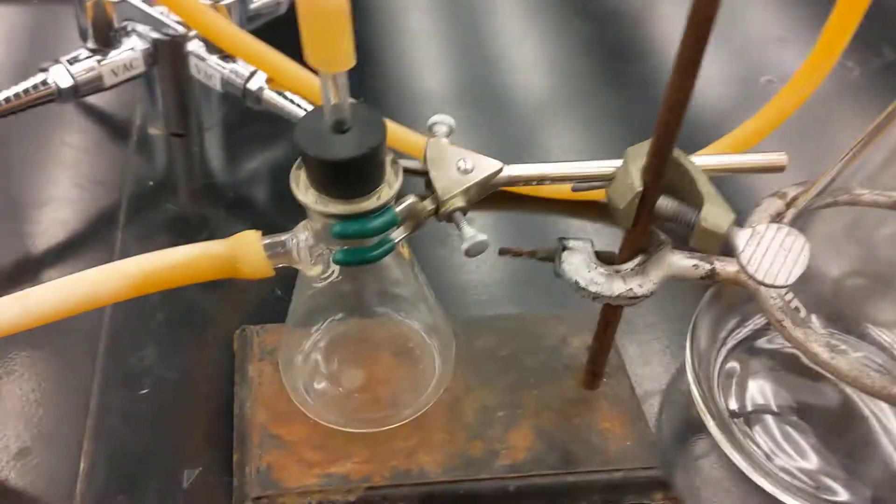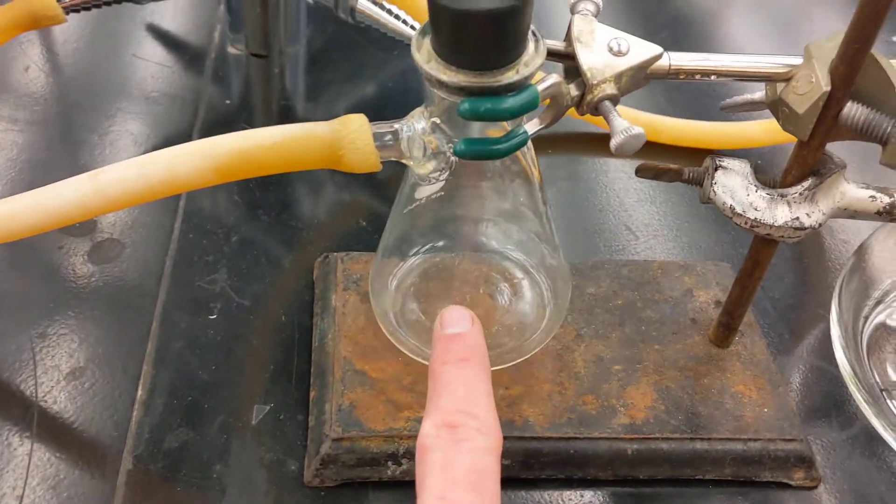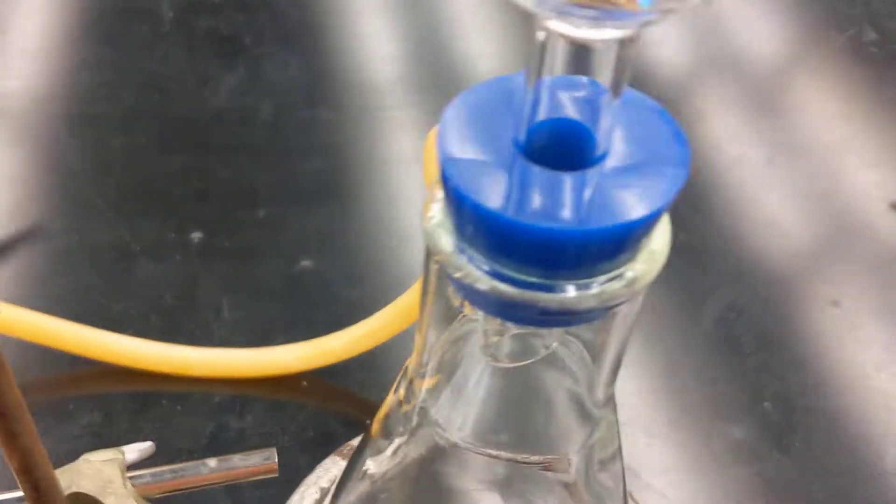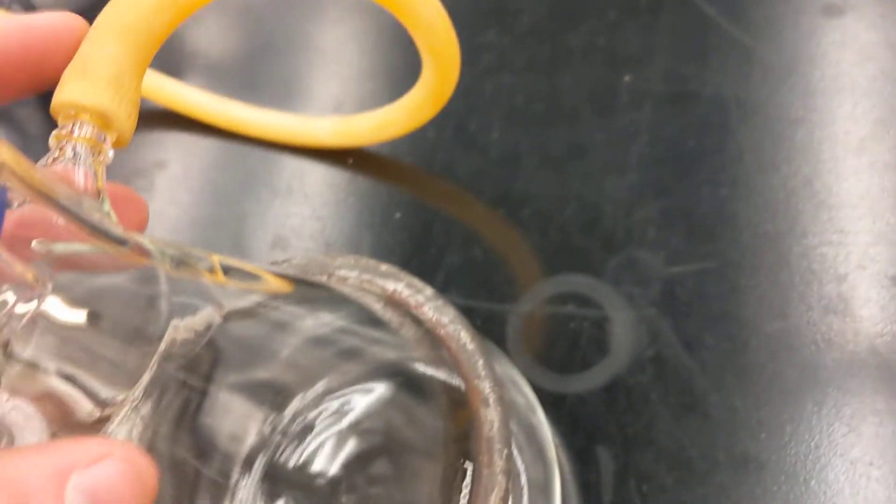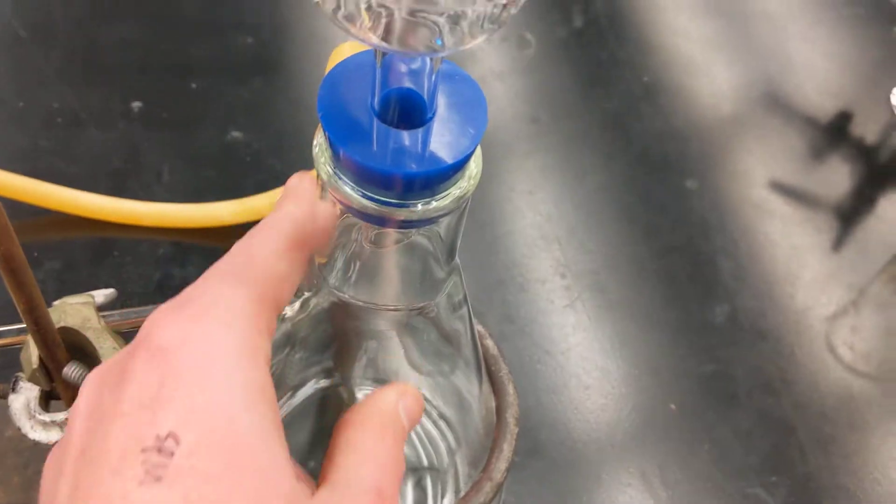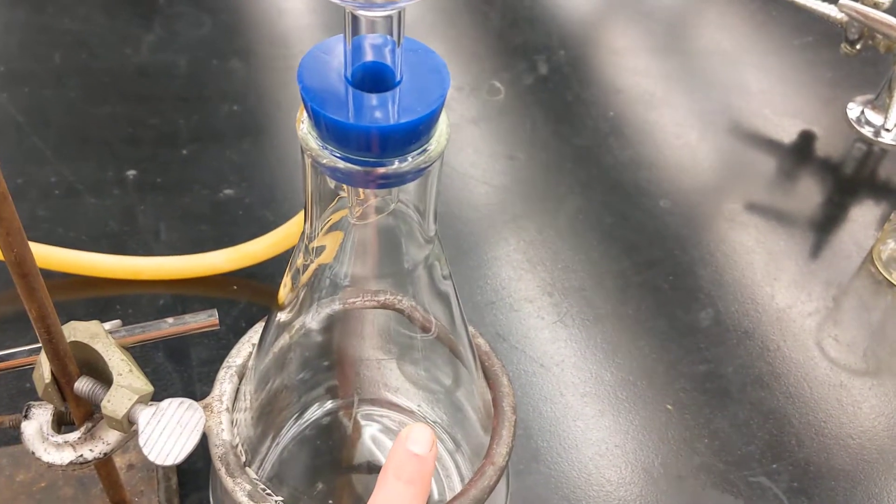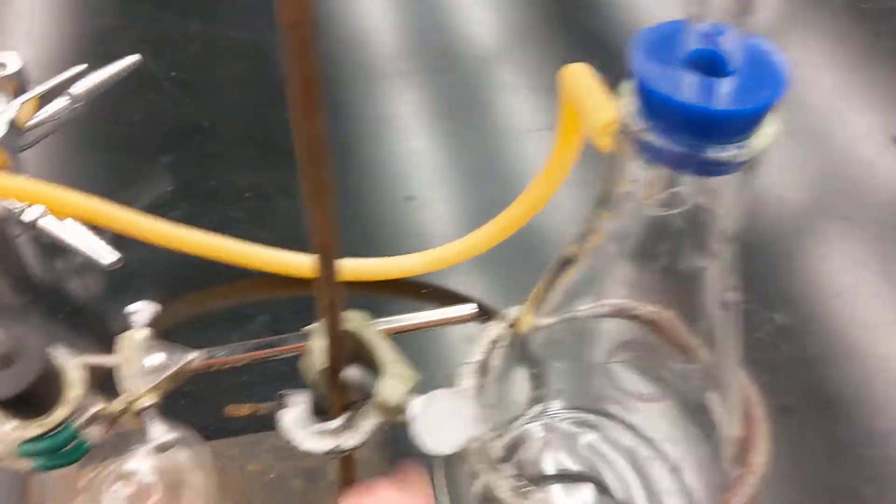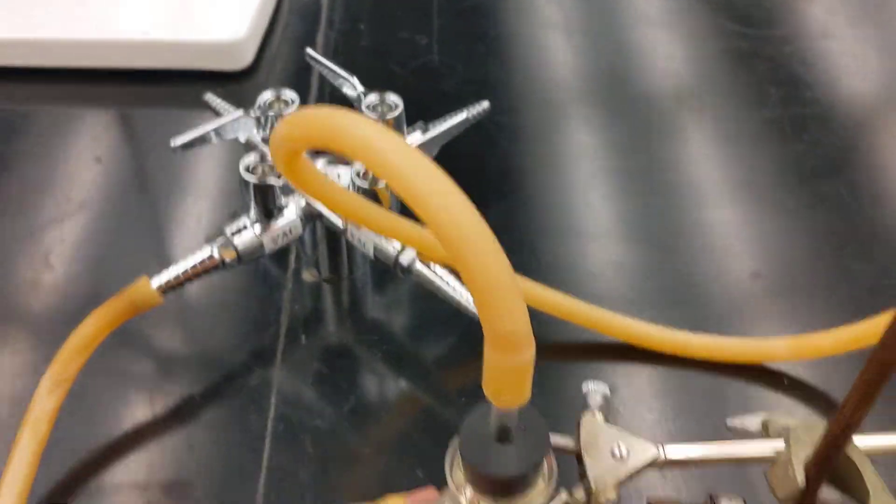The line runs to a small sidearm flask here, onto the side, and then out at the top and into the sidearm of a 1 liter flask. This is where the sample will be filtered into. This is a trap in case some water goes through the vacuum line. It won't destroy our vacuum system.